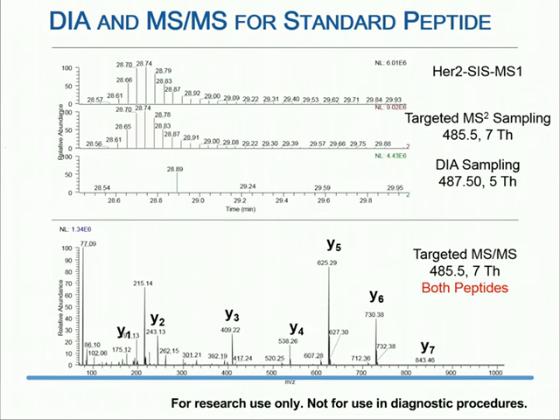We're able to capture both peptides in this window and make multiple measurements using the different fragment ions. In this case, the difference between the stable isotope-labeled standard and the endogenous is mainly going to be reflected in the Y6. Y7 is kind of low intensity, so we didn't quantify there. But because we stable isotope-labeled that valine that's contained in the Y6, that's the fragment ion that we're going to focus on.